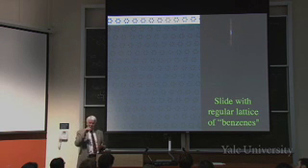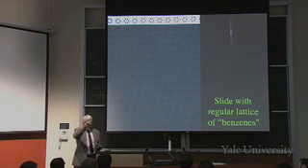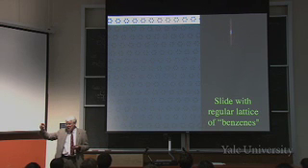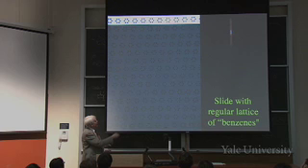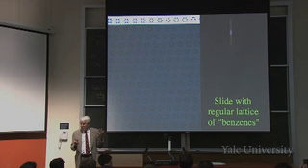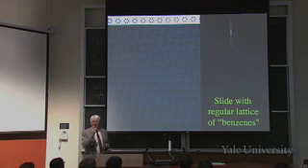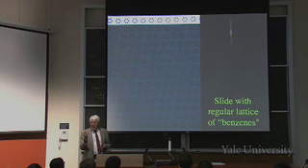For the same direction of scattering, up and down, where that top row is all in phase, we would get the scattering shown here, right? Stronger than it was before because it's a bunch of these things now, but still not really strong. But let's add in the next row. Is that going to make them all stronger again?